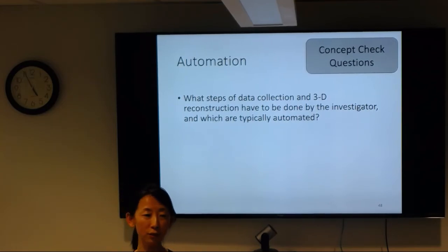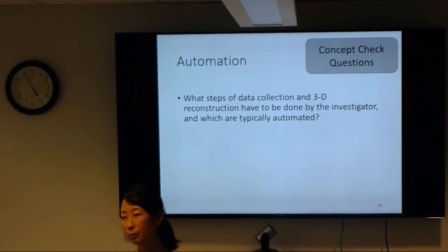Quality of the images, how thick they are, the contrast of the image. But you can even do it on the fly. You can do batch processing by IMOD. And then once you have the tomogram, annotation really is not automatic. You have to know your biological story.